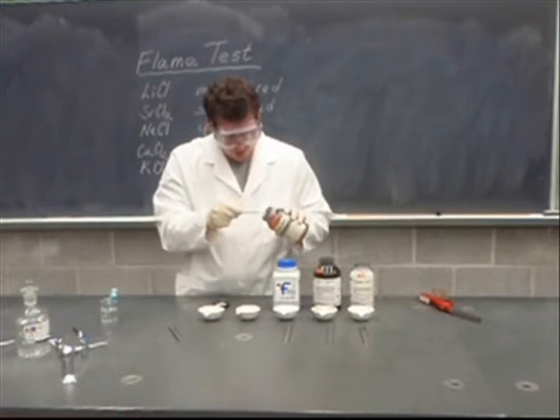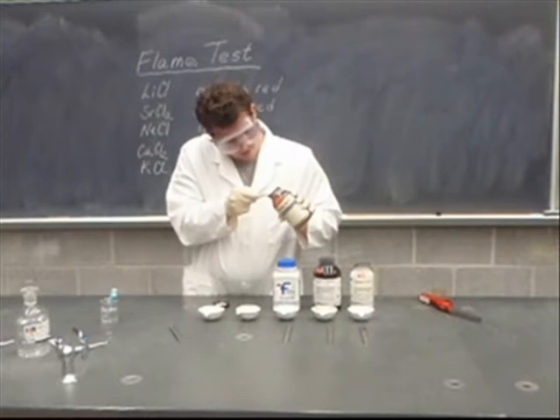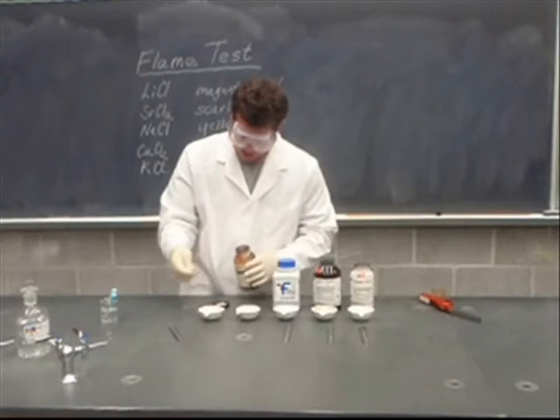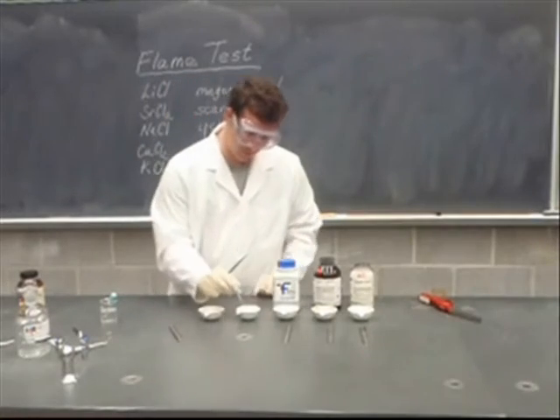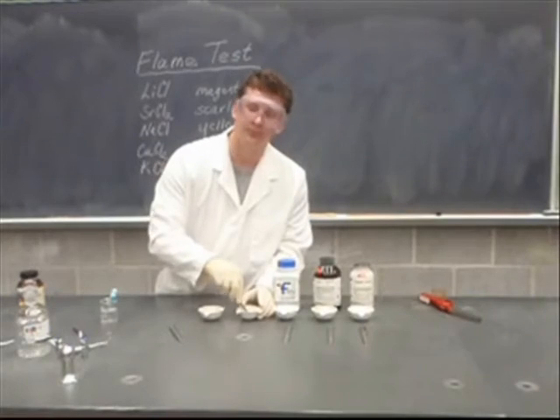The gas we're going to be burning ours in is going to be methanol. We're going to use it in its liquid form, and as it evaporates, that's what's going to burn. So we'll still be burning the gas, even though it looks like we're using some.